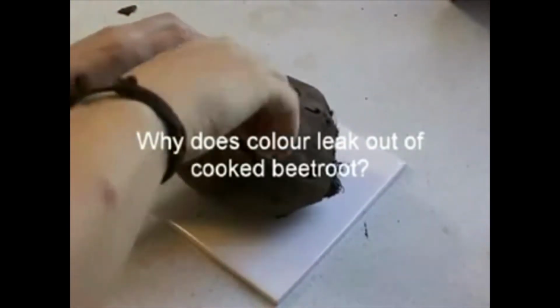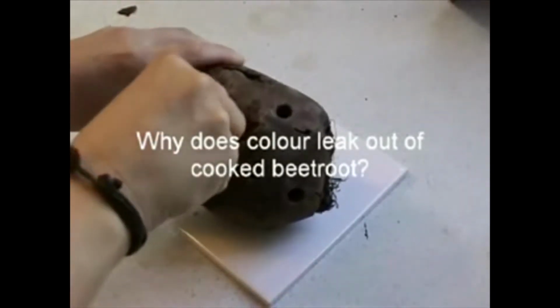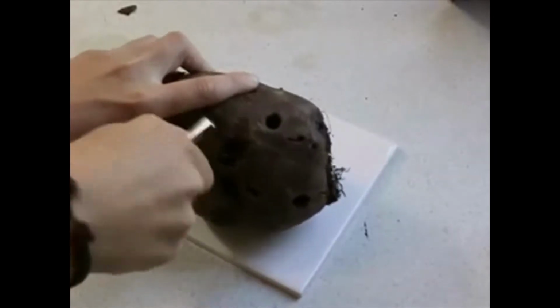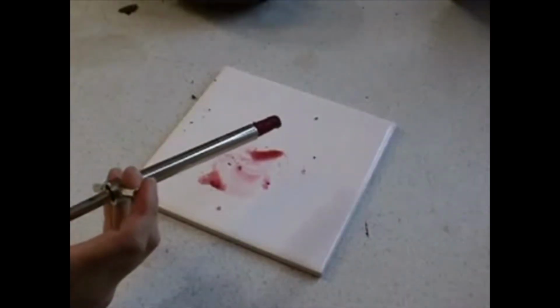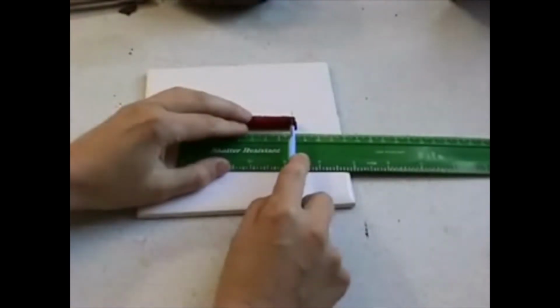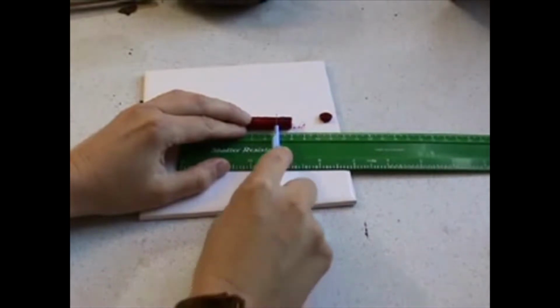In this film we'll be having a look at the effect of temperature on the permeability of membranes in the vegetable beetroot. Here cylinders of beetroot tissue are being removed from the uncooked beetroot using a device called a cork borer. You can see the purple pigment, which is called betalain, on the white tile. And you see the flesh of the beetroot is deep purple in colour.